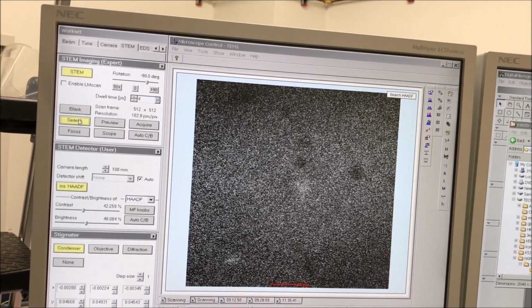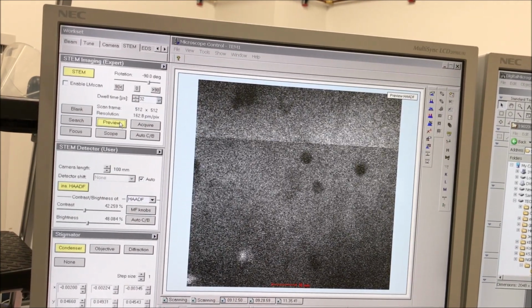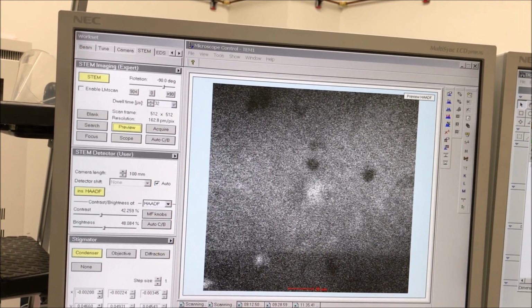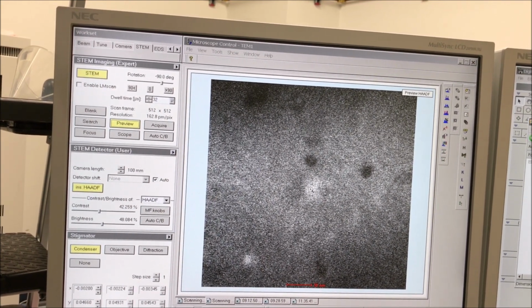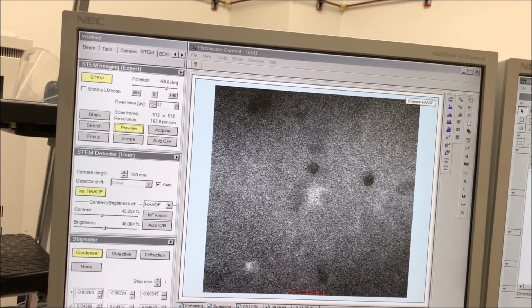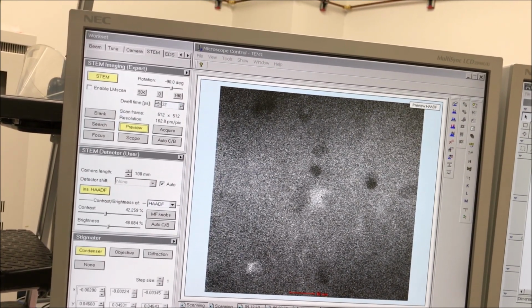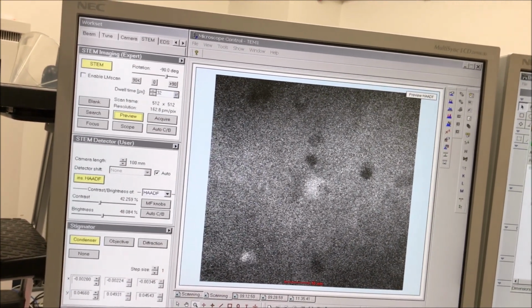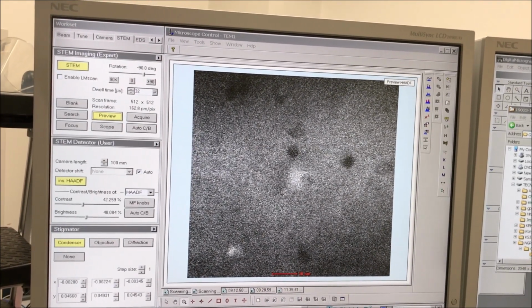And so you can see even now, I had the beam frozen here before I was scanning, and even after the shower, because I had the beam sitting in that spot, we are still getting contamination buildup. We weren't really seeing it before because the beam wasn't stationary, but even after the shower, if you just sit the beam in one spot, you can end up with a contamination issue.